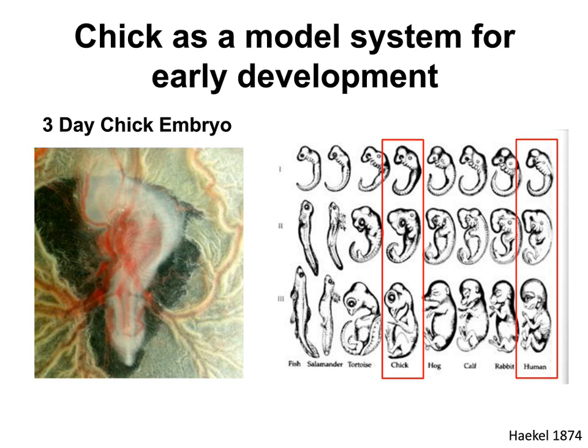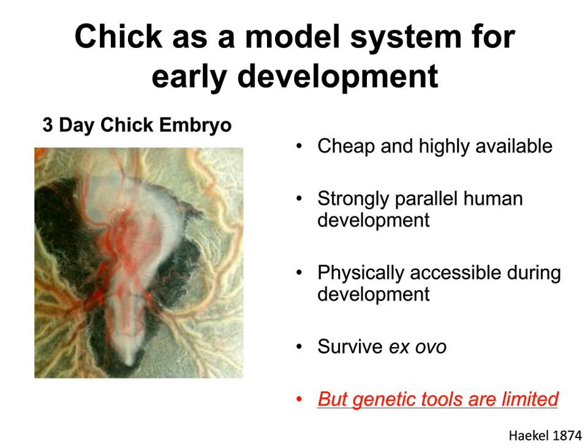In addition, fertilized chick eggs are relatively cheap and readily available. Most important to the studies in mechanical forces, the chick embryo is actually very accessible. So you can simply cut a hole in the egg, perform some genetic or physical manipulation, and then simply put a piece of tape over that hole, and the embryo continues developing completely normally.